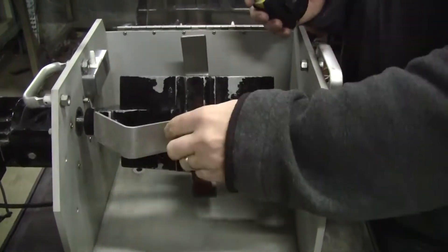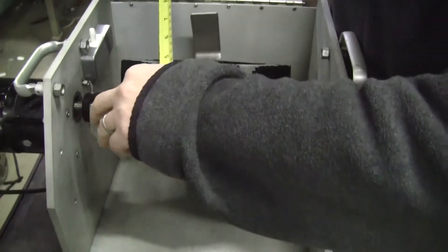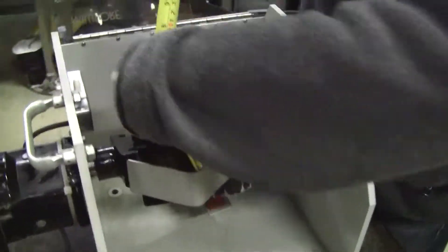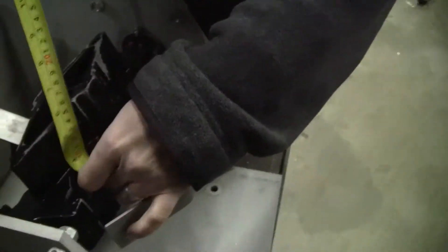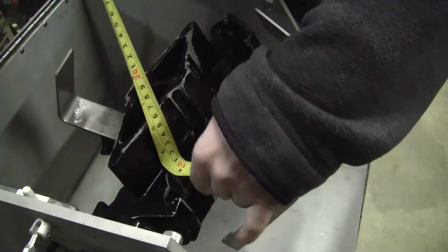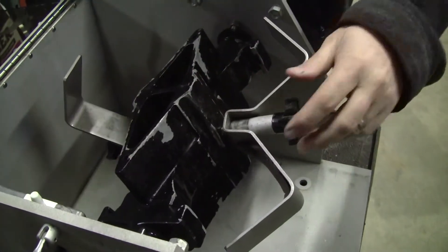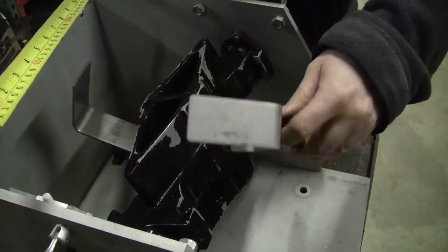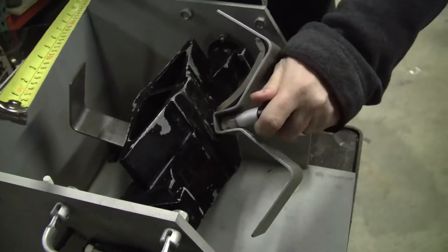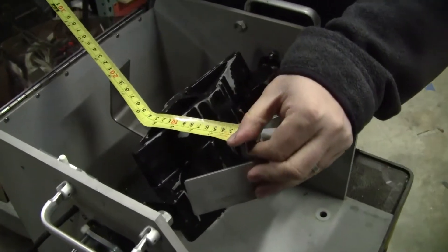As far as diameter of bottles, we have an opening here of approximately three and a half, maybe getting to three and three quarters of an opening. I'm assuming this just tightens down on your bottles or your sample. That seems to be as far as it's going to go, meaning the diameter then is about three and a half.